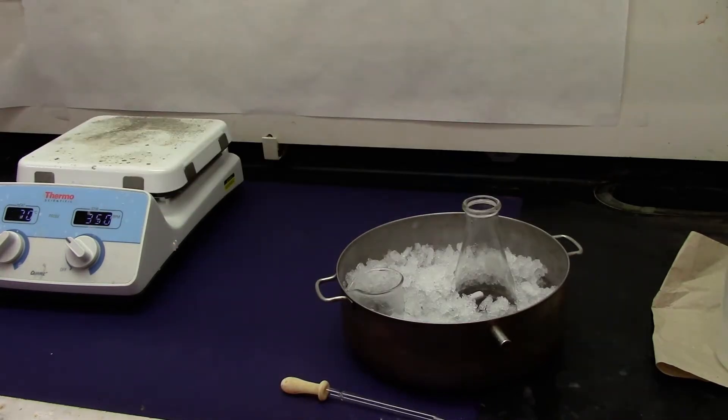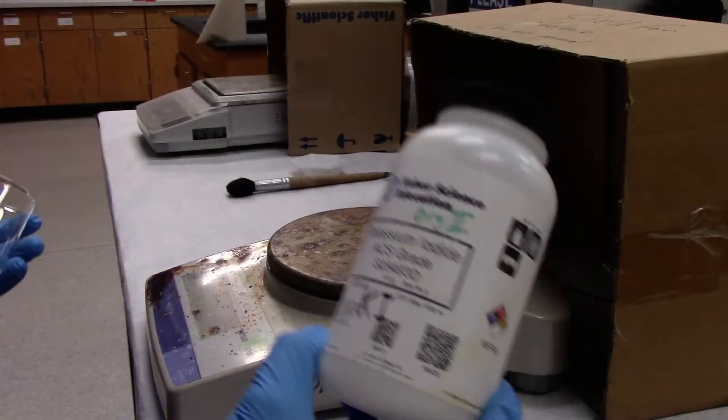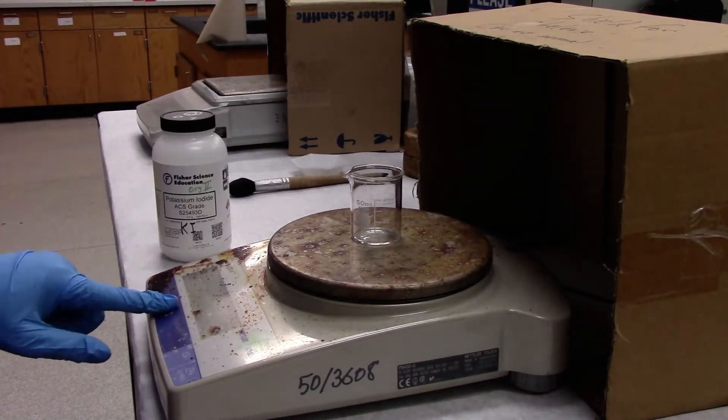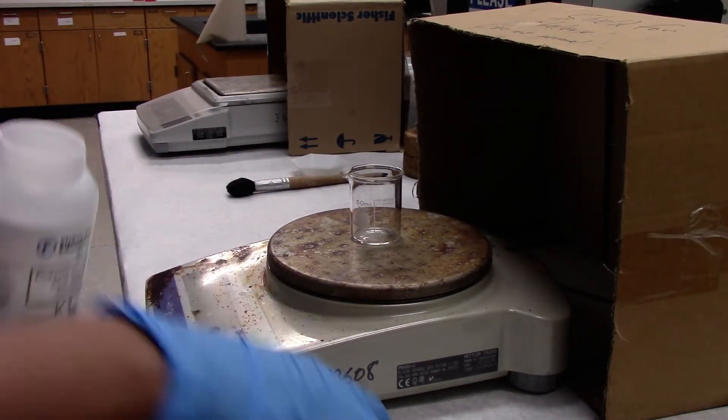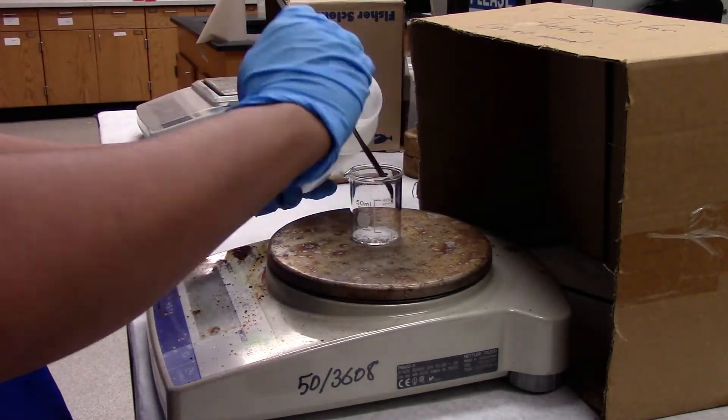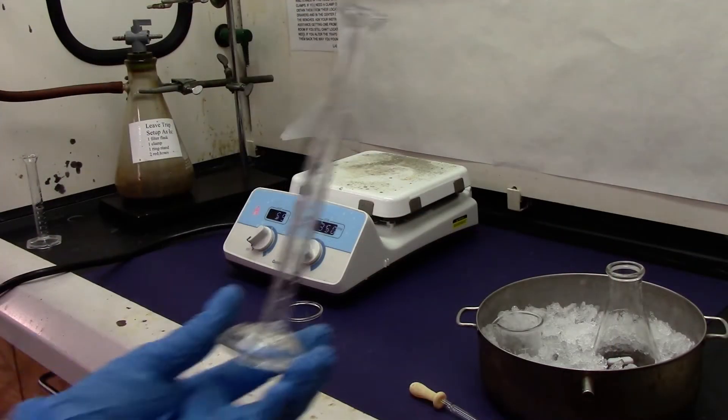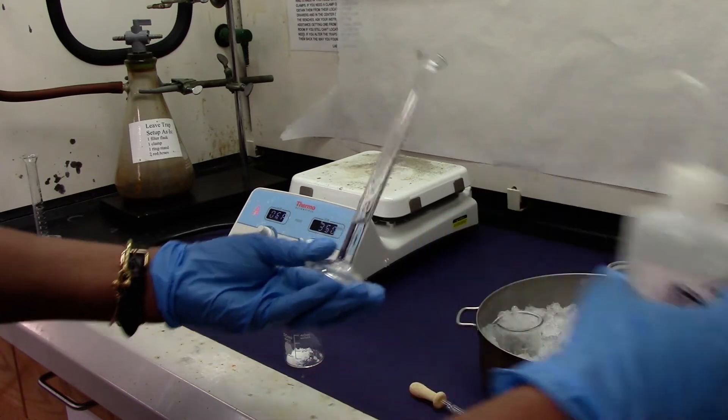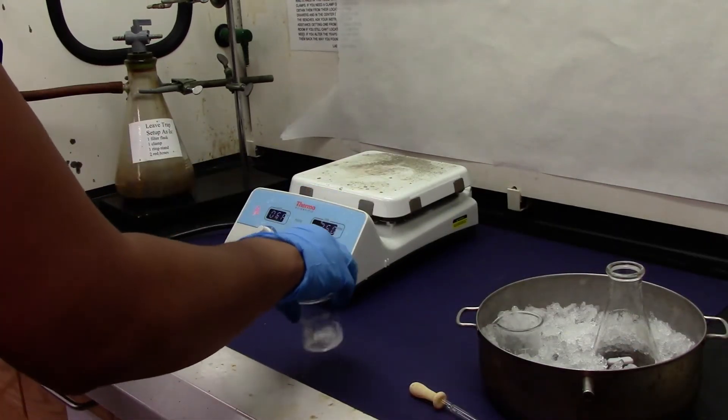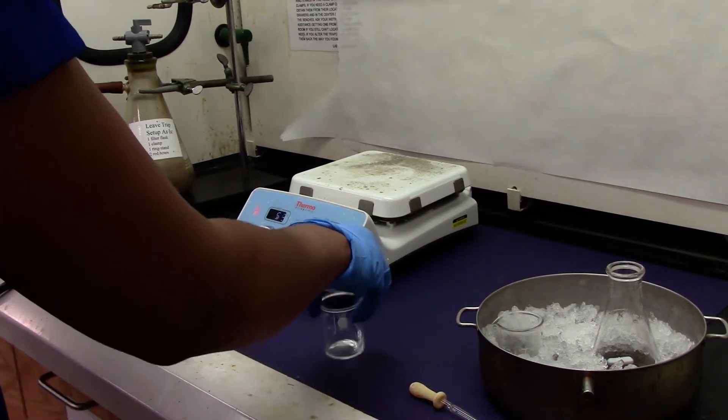We'll give it about 5 to 10 minutes for both solutions to cool down before we start adding. Weighing potassium iodide in a small beaker. Tare the beaker and add approximately 1.8 grams of potassium iodide. To the potassium iodide I'm going to add 3 mL of DI water, swirl to make a solution, and let it stand for a few minutes.